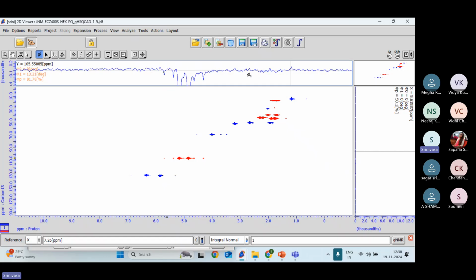phasing. Now earlier it was like this. Maybe this is phase error. Okay. Make it, if it is negative, make it completely negative. In this case, I made it negative. Then right click hold. When you right click hold, you can see the finger icon. Then just drag it in the middle.